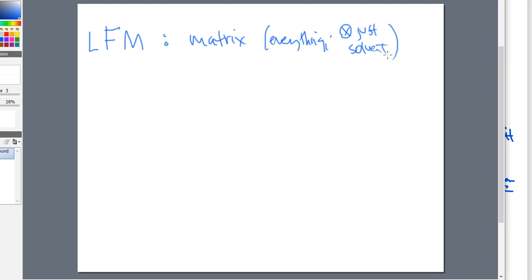We don't want the analyte to bring a family to the picture that's going to get themselves involved in the analysis portion of the samples and the standards and the reporting. And that family is called the matrix, okay? So, laboratory fortified matrix. It is the same as the LFB, except this involves the matrix portion of the samples, not just the solvents, aka the blanks.